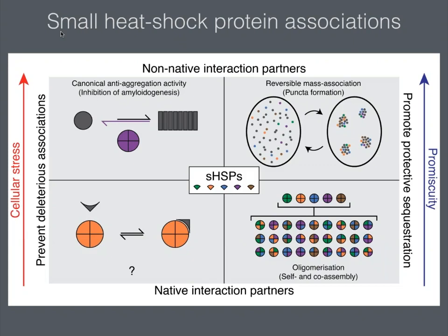And the proteins are not just important, they've also turned out to be really quite challenging to study by a whole bunch of methodologies. I'm just going to focus on one quadrant of this chart. I'm going to talk about the fact that these proteins have a real tendency to oligomerize, and not just with themselves, self-assembly, but also to co-assemble. In other words, forming mixtures or oligomers that are mixtures of subunits, heterooligomers.